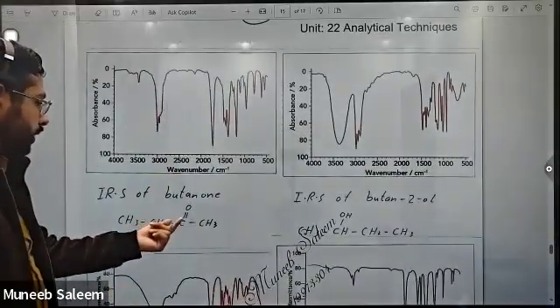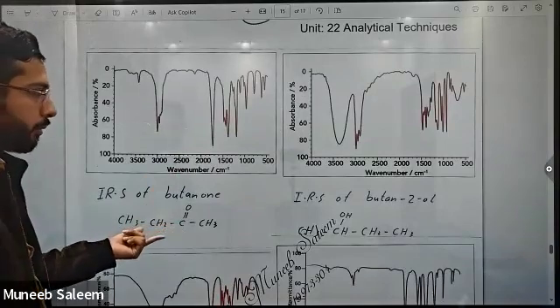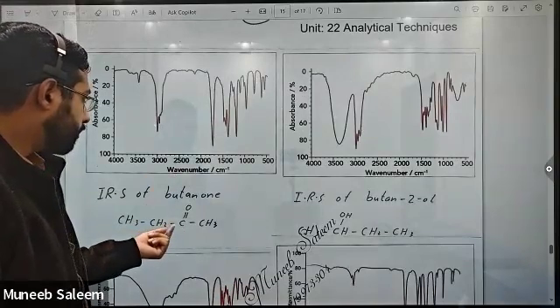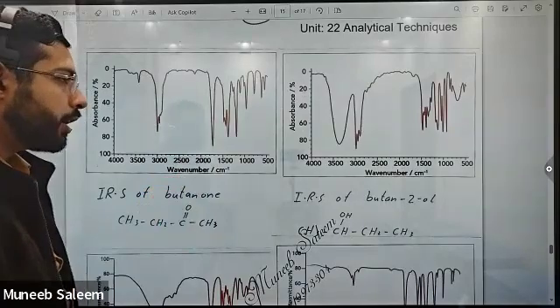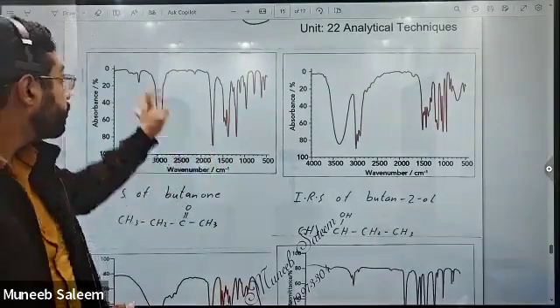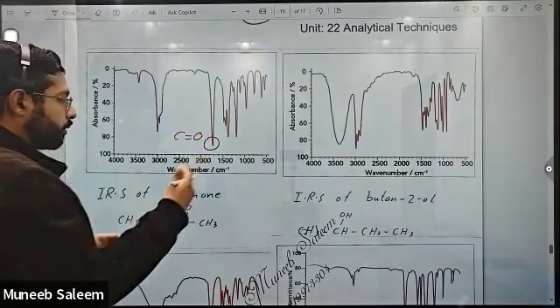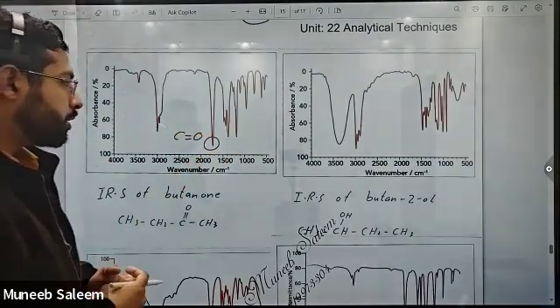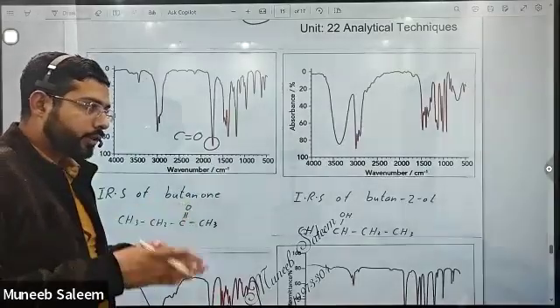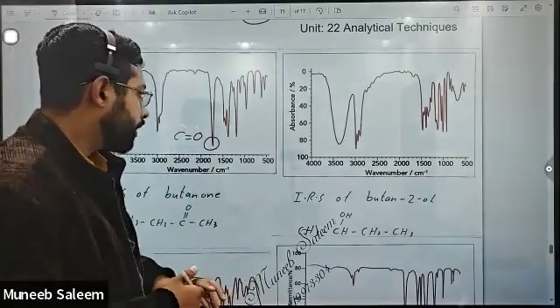This IR spectrum belongs to the ketone. So in case of ketone, you have to check from the table at which position the carbonyl bond belongs. It is mostly in the range of 1700 to 1750 per centimeter. So we can find this intense peak, which is an indication of the carbonyl group. So if the value is already given, or it is very much clear from the table or from the graph that the value is at the right range of the ketone, we can verify it.